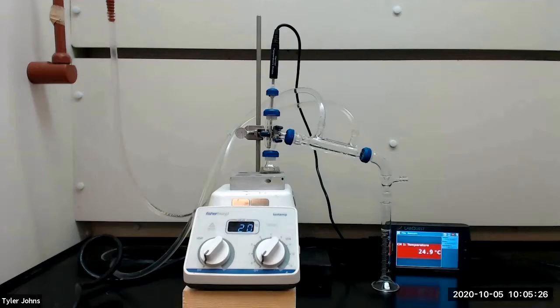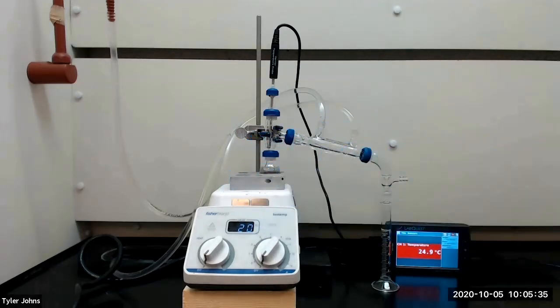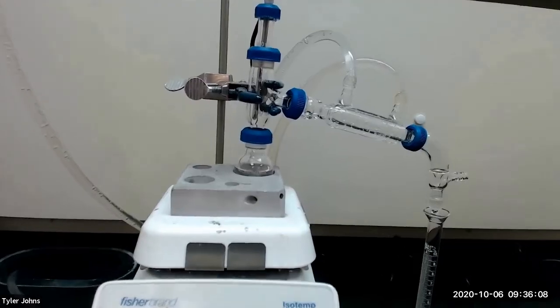Once we've collected 5.0 milliliters of distillate, we will take another sample of distillate in a second GC vial. We'll then continue the distillation until 0.5 milliliters of unknown remains in the round bottom flask.